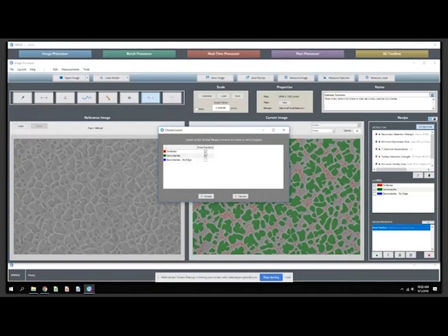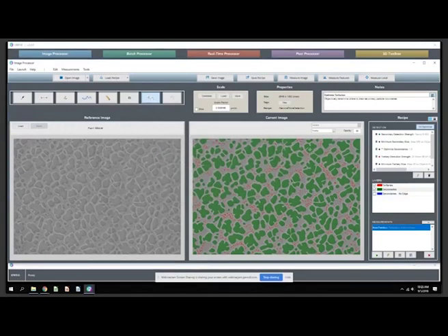So we've programmed the area fraction measure to only run on these two. We're going to save this layer, the fully contained particles, for other size and shape and proximity analysis. So let's go ahead and take a look at some feature measurements and build this report out a bit. Let's say we want to look at proximity and size and even shape-based analysis on a per feature basis. We'll go up to our measure features, and we're going to run these on the no edge secondaries.